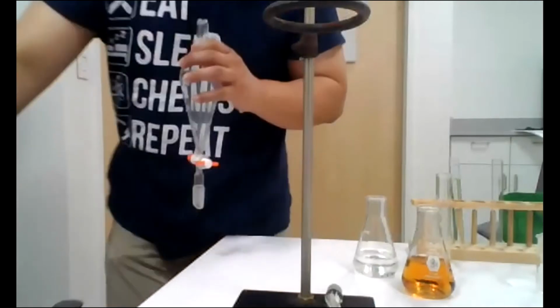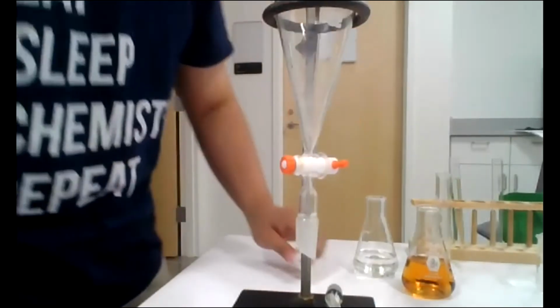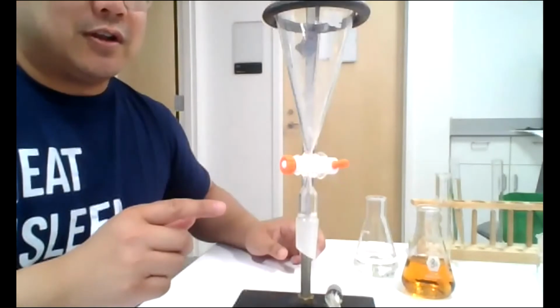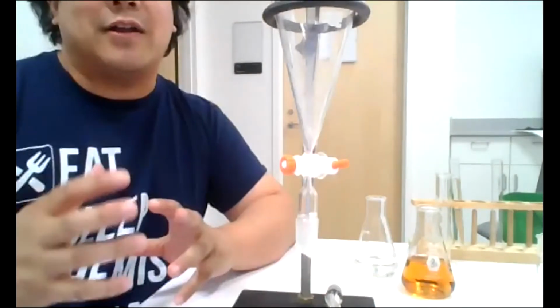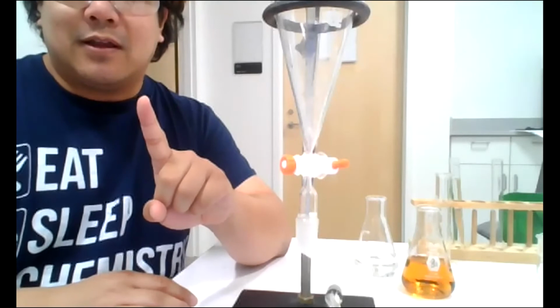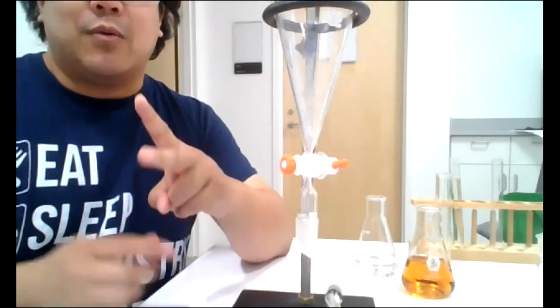Part two is now doing the extraction in parts. Instead of one serving of 20 milliliters of cyclohexane, we're going to use 2 servings, 10 milliliters each. But what does 2 servings mean? It doesn't mean that you just pile on 2 servings. 2 servings means you do it once with 10 milliliters, and then you re-extract the aqueous layer with a second serving.